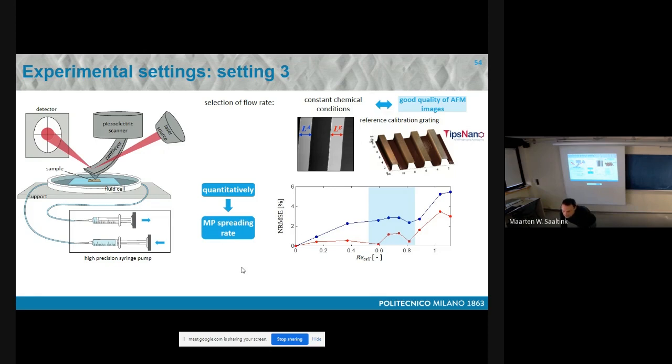You can have a resolution of 10 nanometers even if the wavelength is 600 nanometers, because they measure the signals. My understanding, at least from the work that I saw from Damian, is that he can go to tens of nanometers. I didn't study all the details of the instruments, but that was my understanding.